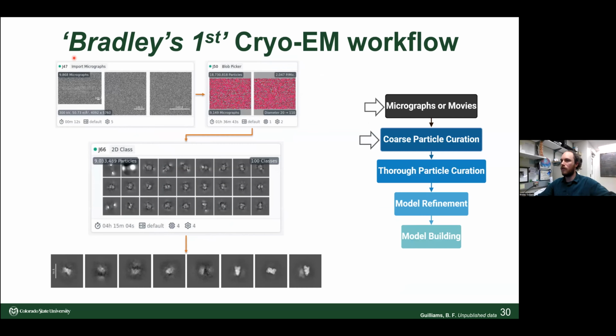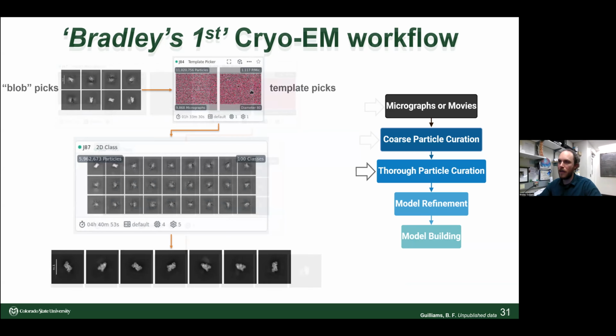Okay, so I'll tell you a story about baby's first cryo-EM workflow with Krios data. So I imported some micrographs. I did some blob picking. I got some classes with some trouble. I'm turning knobs and dials that I don't really know. But eventually I get some classes that look okay, maybe.